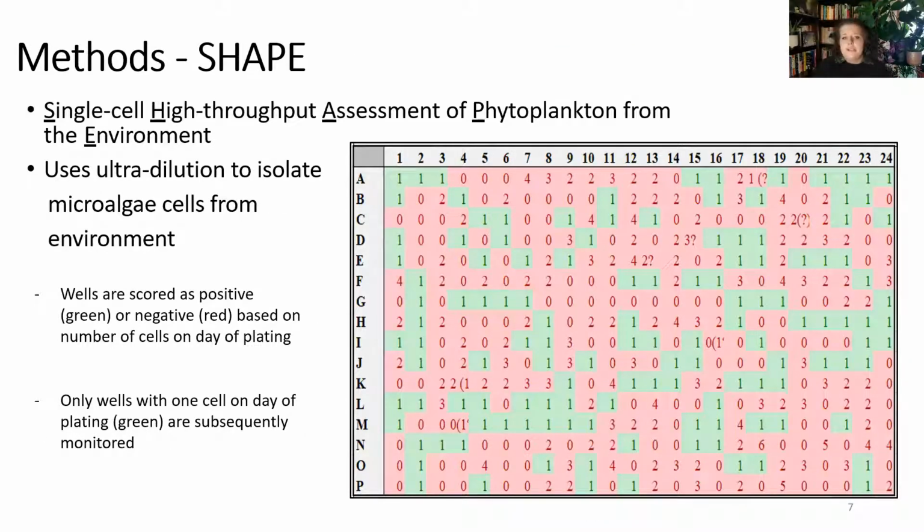So this research involves barcoding strains, that is, cultures with only one kind of microalgae. In order to obtain a microalgae strain, we can either purchase it from an algae facility or isolate it from the environment. I intend to do both, but on this slide, I want to talk about the methods I will use to isolate microalgae strains from environmental samples.